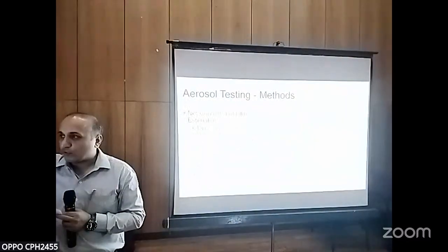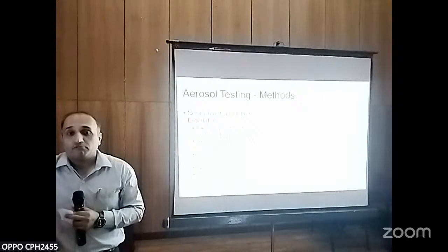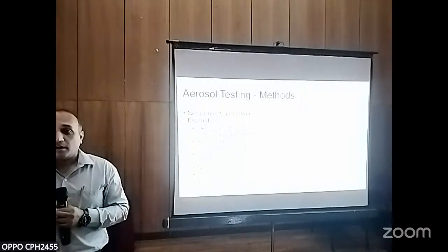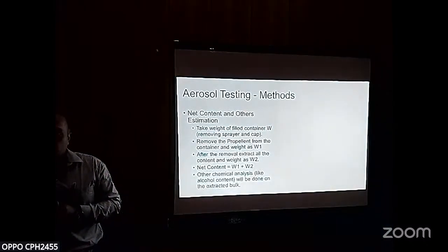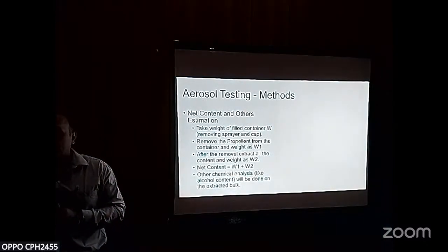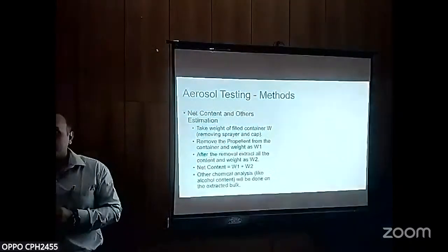Next, coming to aerosol testing, the net content is very critical. We have to estimate whether the declared weight, say 100 grams, is correct, whether the manufacturer has added the desired quantity of propellant and the desired quantity of bulk.